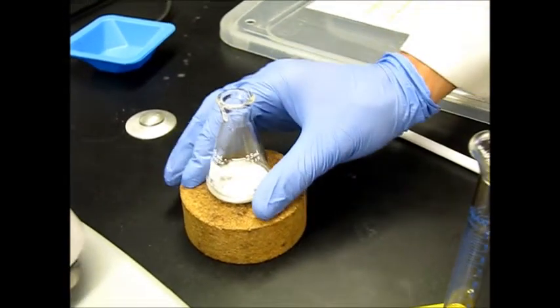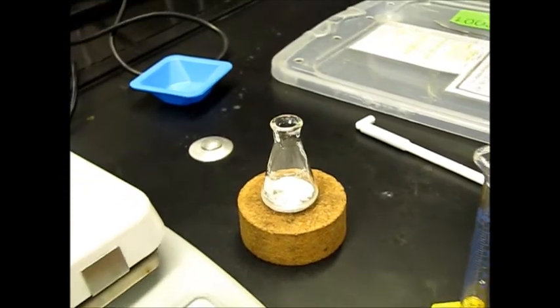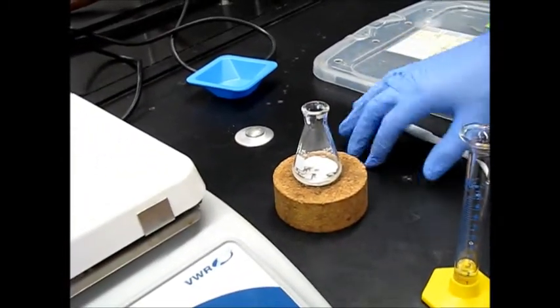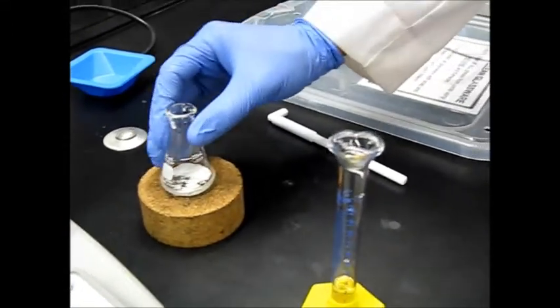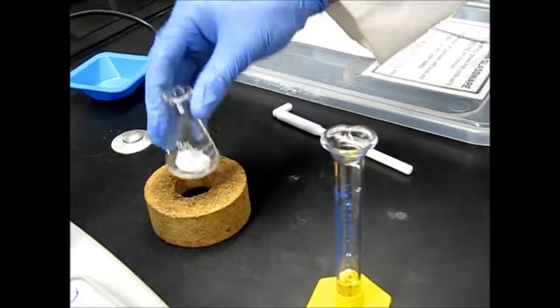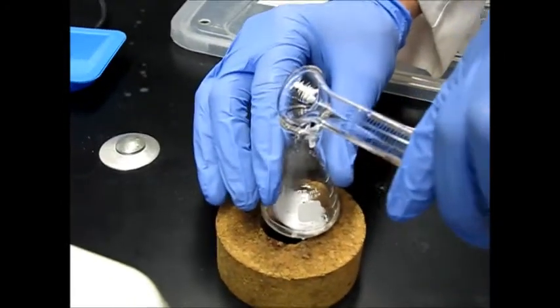For this next part, we're going to allow it to cool down a little bit more. We still have some excess sodium borohydride left in the solution, and we don't want that in here. So we're going to take this reaction flask to the fume hood and add a little bit of 3 molar hydrochloric acid. That's going to react with the excess borohydride and get rid of it as H2 gas. We will see gas evolving, so that's why we're doing it in the fume hood. First we're just going to add a little bit more water just to finish out that precipitation.